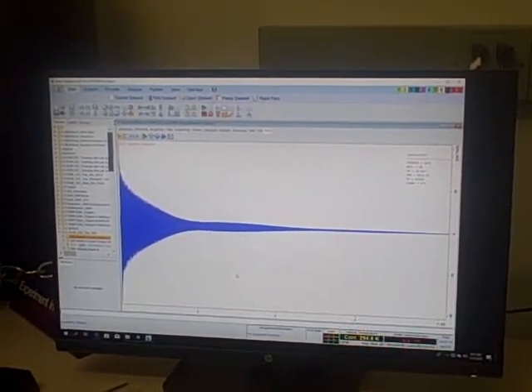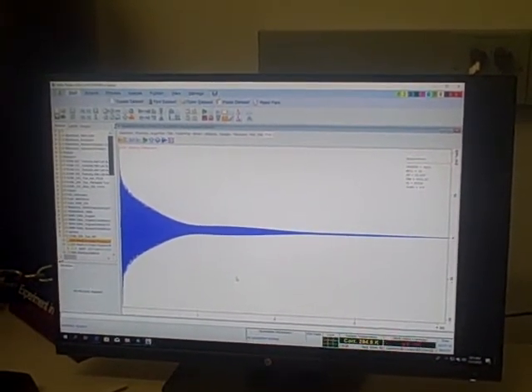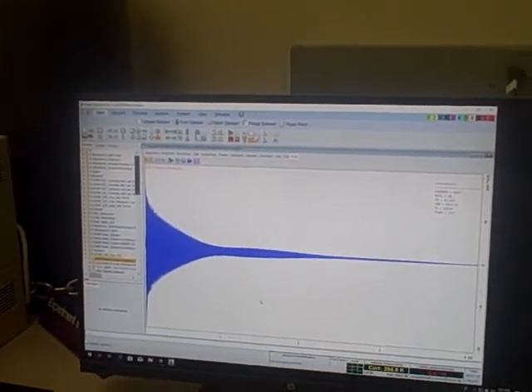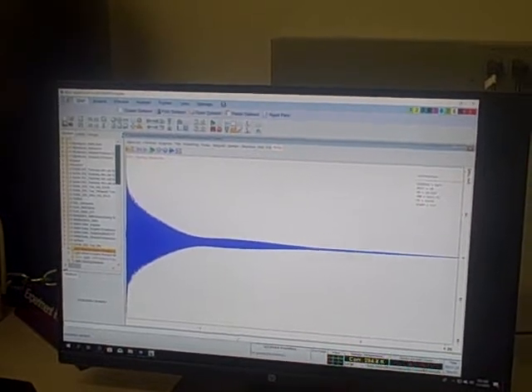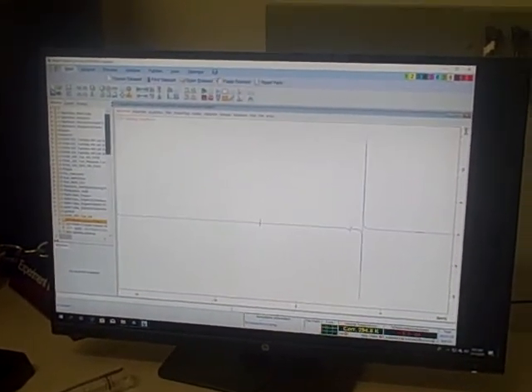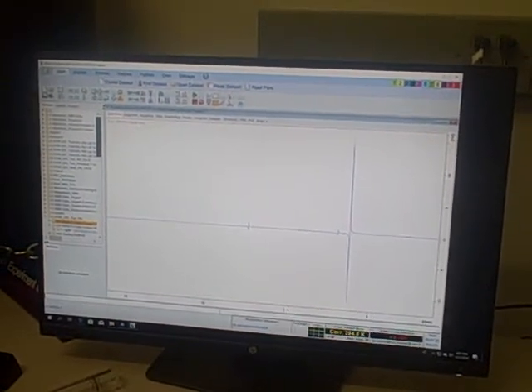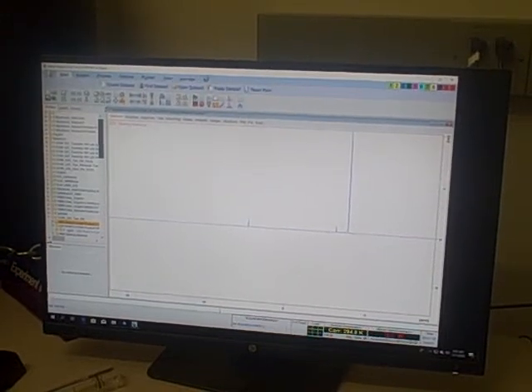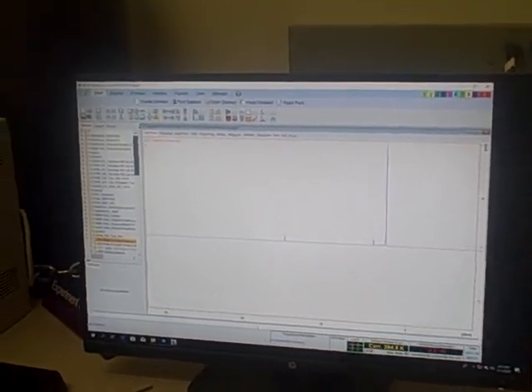So after our acquisition has finished, we will need to transform the data using a Fourier transform. So to do this, we click in the command line and type EF, hit enter, and then we'll phase correct the data by typing APK. After this, your experiment is done. Fantastic. Thanks, guys.